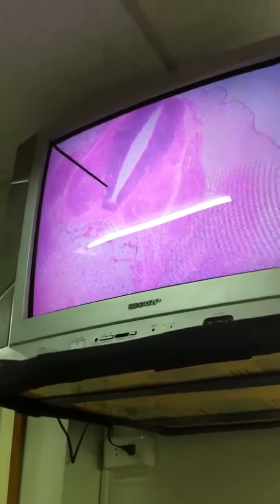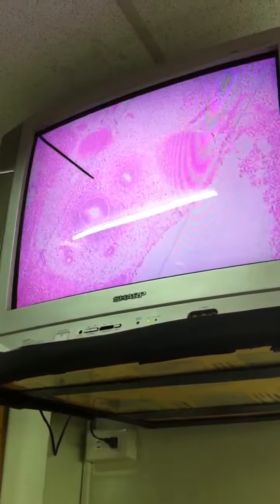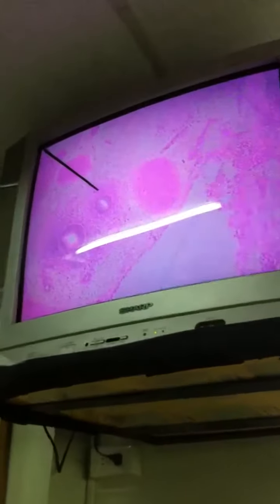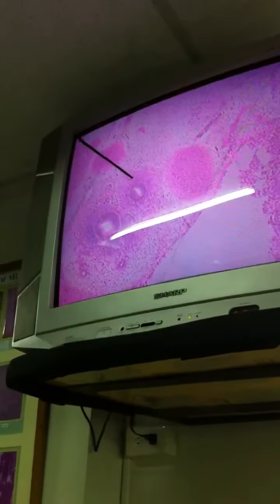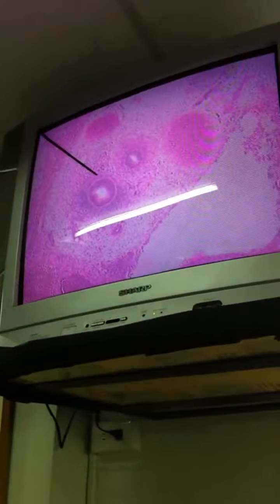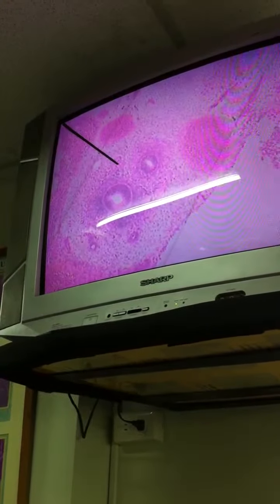of your embryo. So this is just for orientation purposes. Now, below the neural tube, you will find these two openings. Two openings. This is more dorsal. These are the esophagus, and in front of it is your trachea. Okay, so again, these are still for orientation. You look for your esophagus and your trachea.